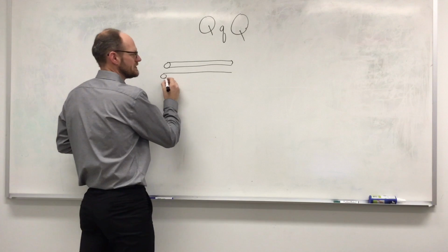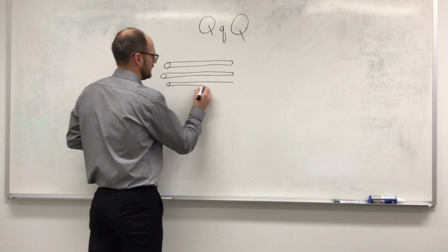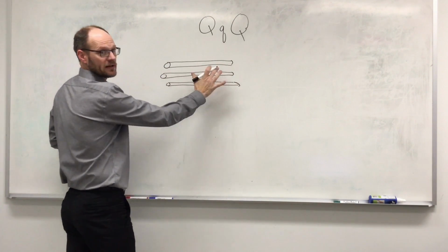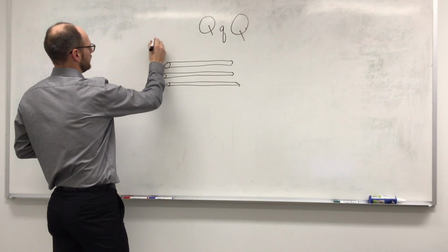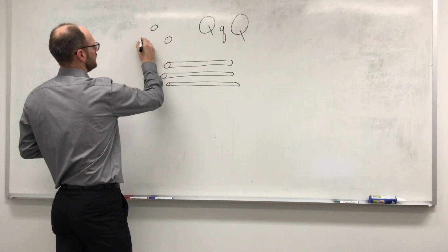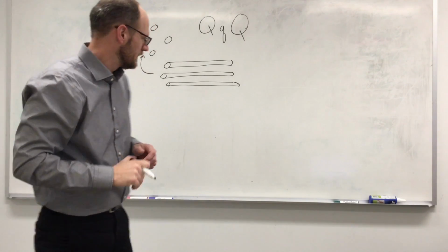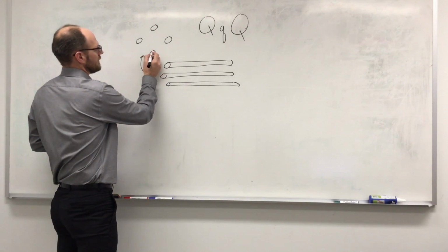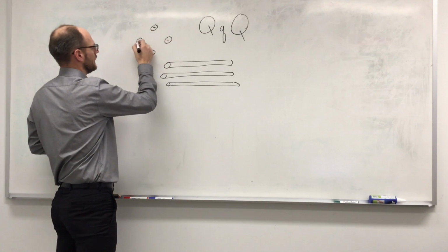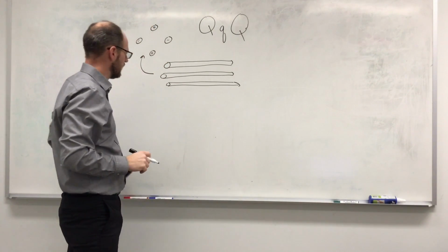It's got 4 rods that are evenly spaced across the length of the instrument. There's another one sort of out here in the plane of the board that you can't see. But if you were to look at this from the side, you would see 4 rods like this. So what happens is each of these rods has either a positive charge or a negative charge, and they're opposite one another here on the device.